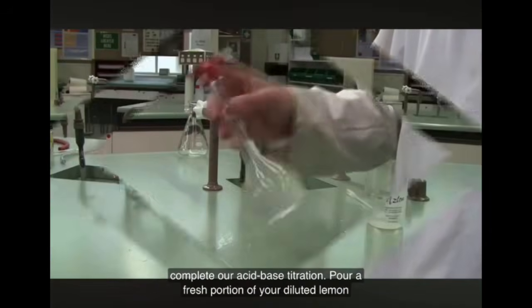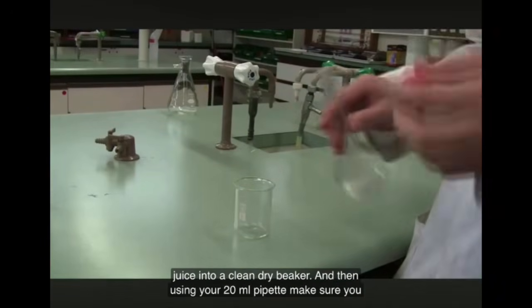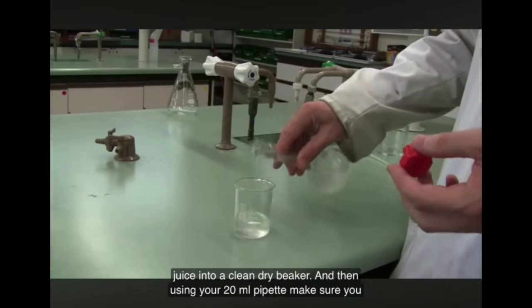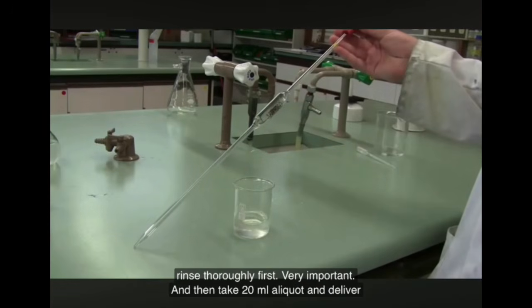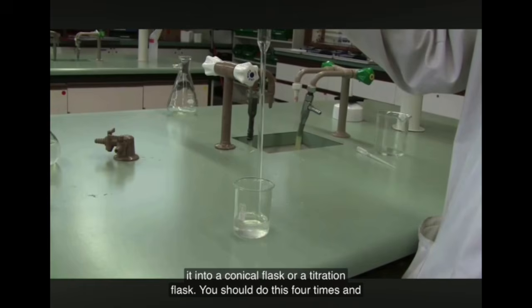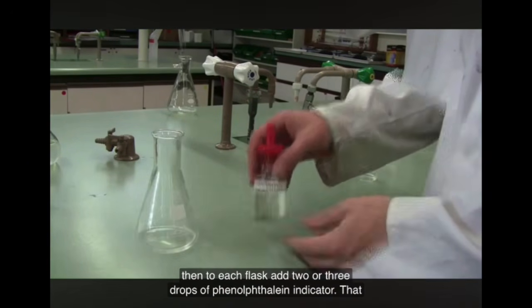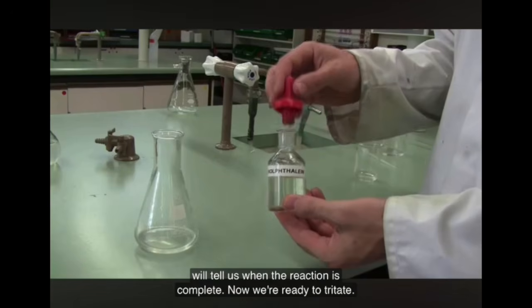Now we're ready to complete our acid-base titration. Pour a fresh portion of your diluted lemon juice into a clean, dry beaker. And then using your 20 ml pipette, make sure you rinse thoroughly first, very important, and then take a 20 ml aliquot and deliver it into a conical flask or a titration flask. You should do this 4 times, and then to each flask, add 2 or 3 drops of phenolphthalein indicator. That will tell us when the reaction is complete.